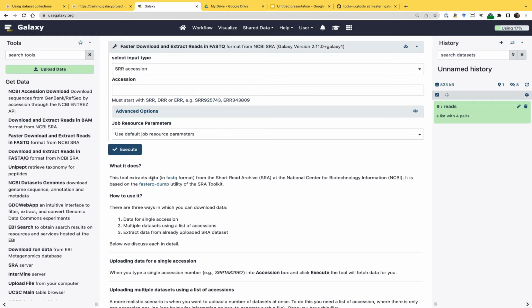But this is only going to be a problem if you have a really large list, say more than 100. It's not our problem, it's the SRA problem: these tools that we're using fail very often. The European short-read archives are better, and they provide explicit links to FASTQ datasets. And NCBI SRA doesn't do that.